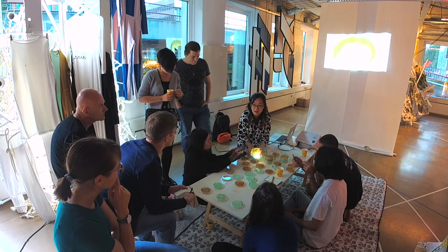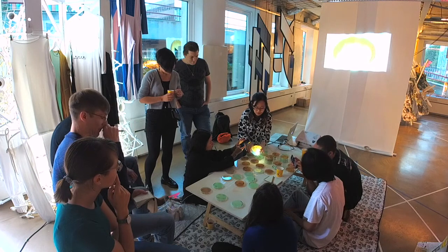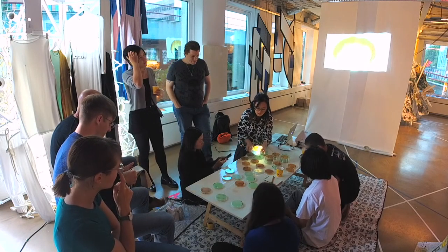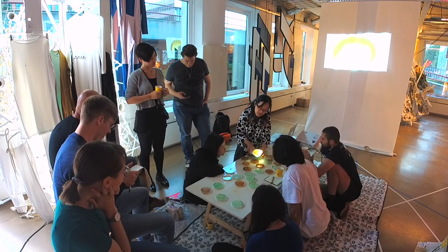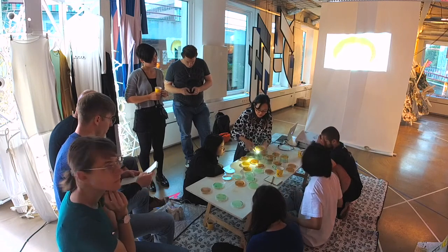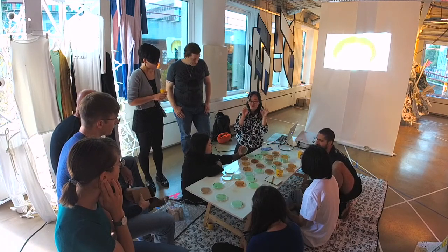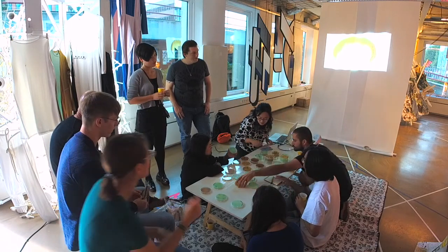So you can see two different shapes. Sometimes they're different colors, sometimes they're different shapes. Sometimes they also have different growth speed. Some of them tend to grow faster, some slower. So throughout time, I think these are a little bit too small to do that, I mean the size of the Petri dish. If you use a larger Petri dish, you can mark the edges of it day by day and see how fast each one grows, like a recording of it. This one is also really good.